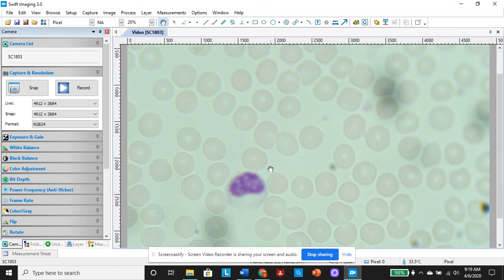I got some cool slides that I will share with you guys. But I just wanted to show you some human blood, and some of the things that are floating around in your body. And, oh, fun fact, human blood is a tissue. Yeah, buddy, figure that one out.